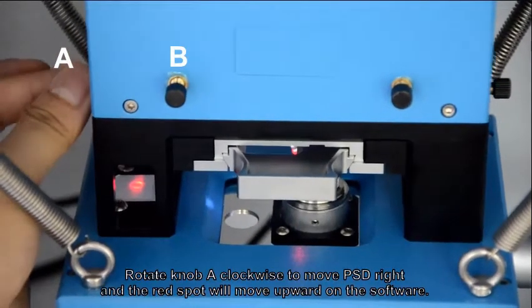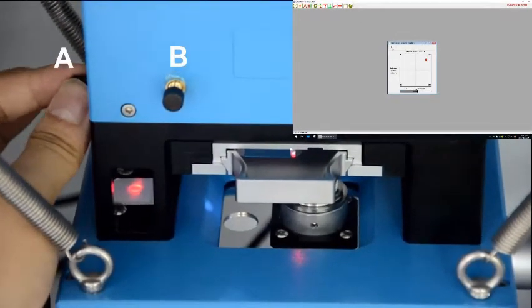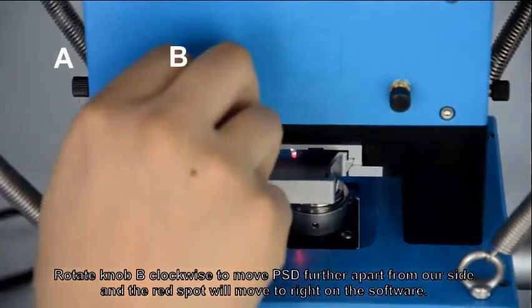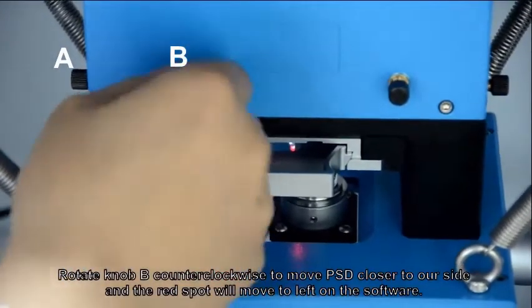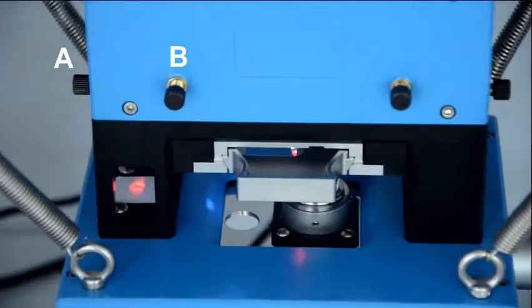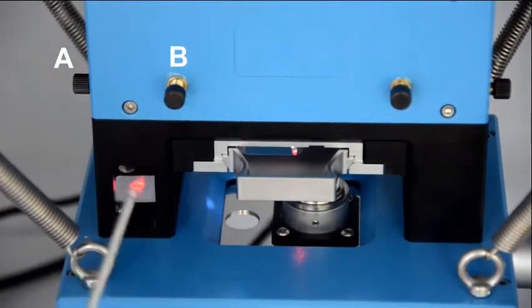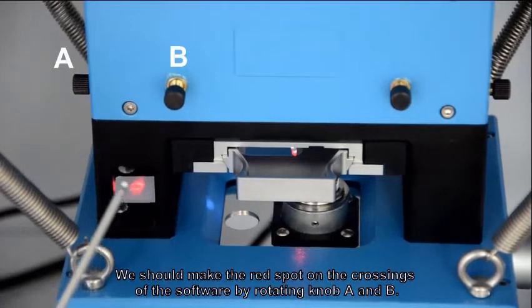Rotate knob A clockwise to move PSD right — the rest bulb will move upward on the software. Rotate knob A counterclockwise to move PSD left — the rest bulb will move downward. Rotate knob B clockwise to move the PSD further apart from our side — the rest bulb will move right on the software. Rotate knob B counterclockwise to move PSD closer to our side — the rest bulb will move left. The movement of the rest bulb should be synchronous with our adjustment and the energy bar should not have large fluctuations. Make the rest bulb land on the crossings of the software by rotating knob A and B.